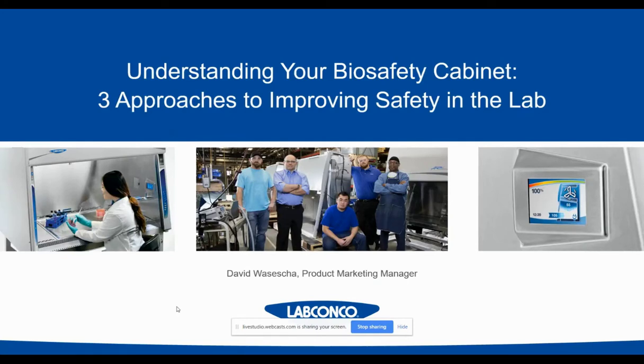Thanks so much for the introduction, and thanks to everyone who's taking a portion of your day out to learn a little bit more about biosafety cabinets. They're obviously a well-known, important tool in many laboratories, and so today we're going to look at just some basics about some of the biosafety cabinet options and types and when they should be used and taken advantage of. Also, we're going to talk about a couple of ways to look at the types of biosafety cabinets in relation to user safety and features and functions of each of those biosafety cabinets and how users can understand what's happening with their biosafety cabinets better than they may know.